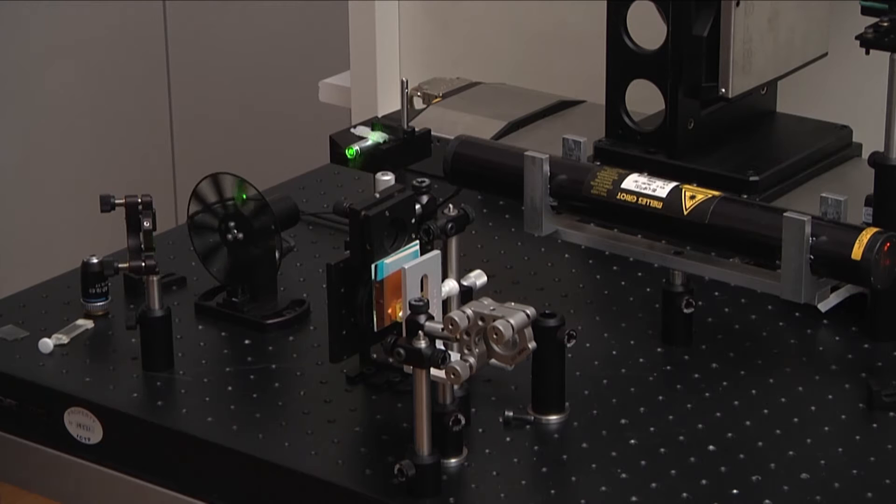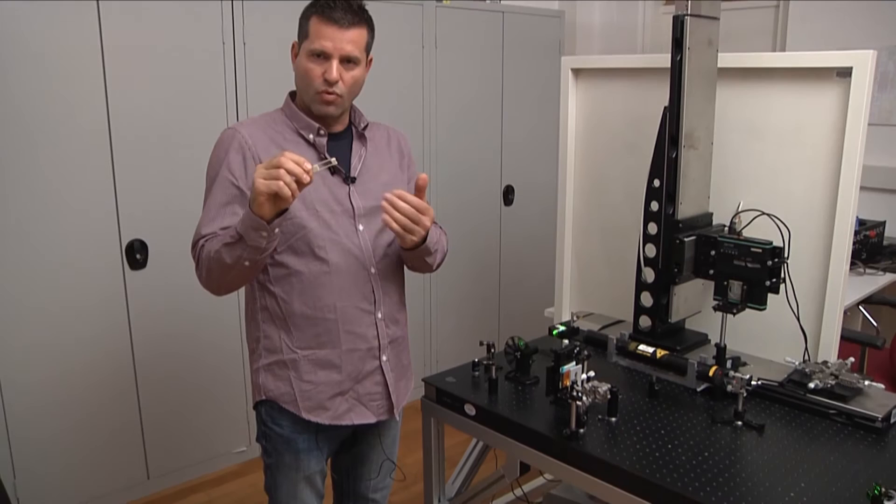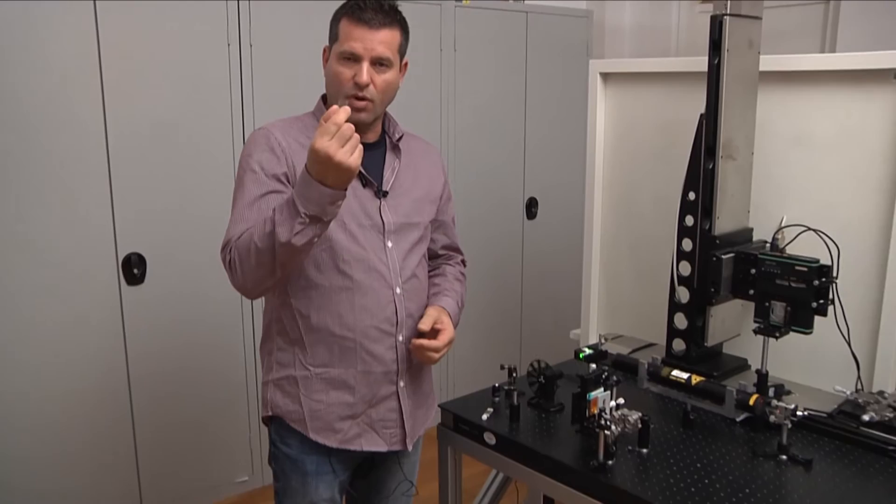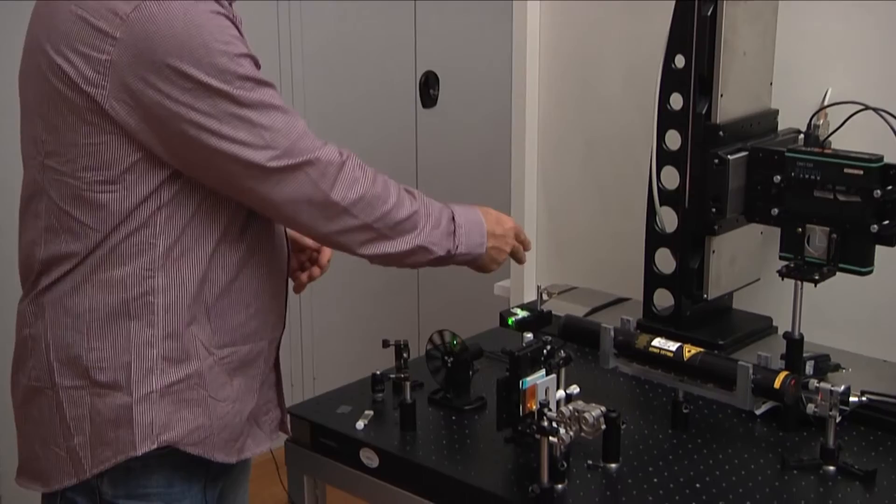this sample that is, in this case, pure ethanol or pure water or semiconductor materials, in which we excite, we put the sample here before this mirror and we excite periodically with this green laser.